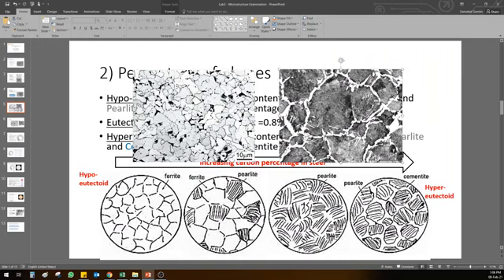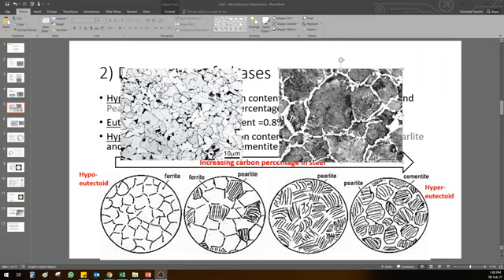For the microstructure on the right side, how do you answer this question? What are the percentages of each phase in the microstructure on the right side? In this microstructure, I have two phases: the black one is pearlite and the white lines are cementite.